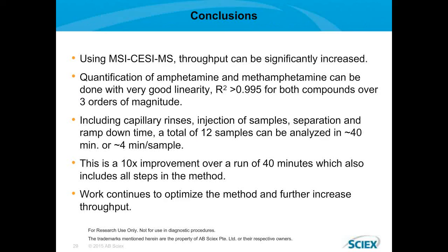So my concluding remarks are very general. Using multi-segment injections, CESI-MS, it's clear that we can increase throughput significantly using this particular technique. The quantification of the case study analytes was all done with very good linearity, over 3 orders of magnitude.